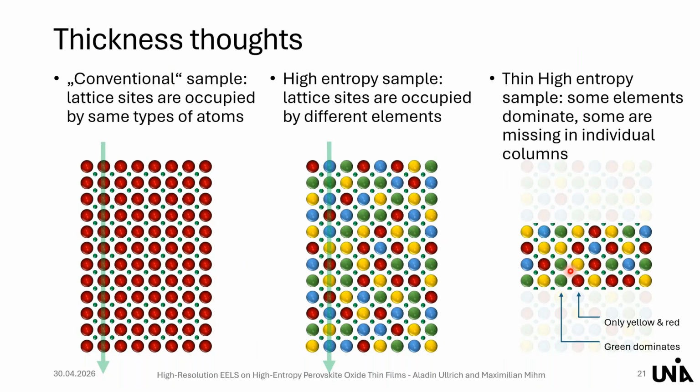To get such thin samples, you can use, for example, focused ion beam preparation, as we applied for our samples. And to get a real high quality ultra thin sample without any kind of amorphous layers on top and bottom, you must go down with the energy of your beam. Finally, we polished our sample with 1 kV ions at the end to get the best out of it.